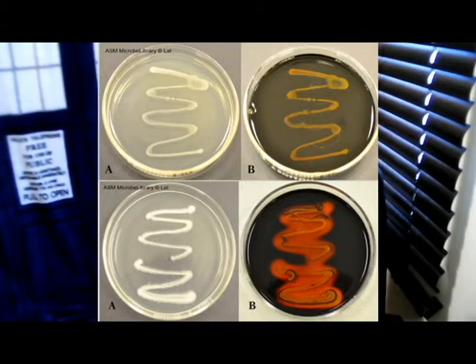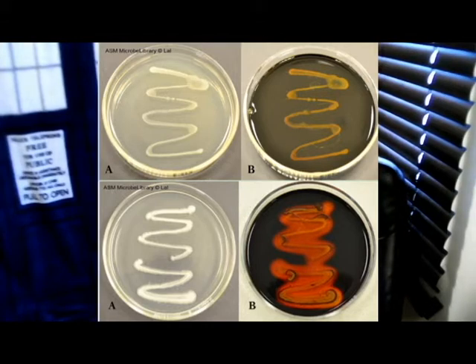So knowing that process, knowing what that process tells you, if you add iodine to a starch hydrolysis agar plate, and you see that the bacteria streak is there, and then the iodine covers the entire background of the streak, then it was not able to hydrolyze the starch around it. But if you streaked the bacteria and then put iodine on it, and there's like a halo around the streak that you made, that is an indication of the bacteria's ability to hydrolyze starch.